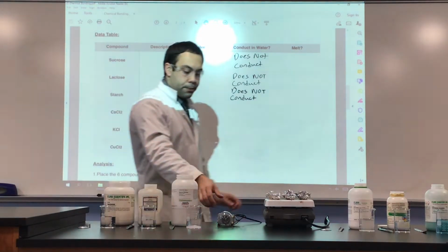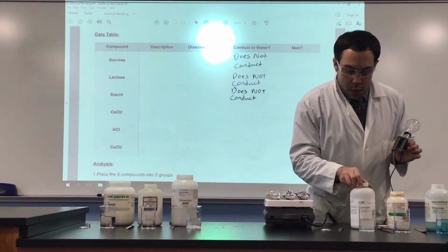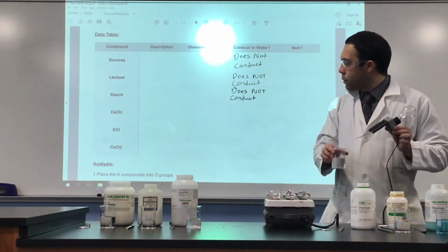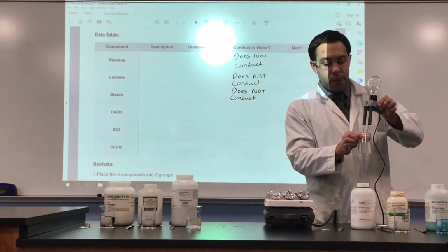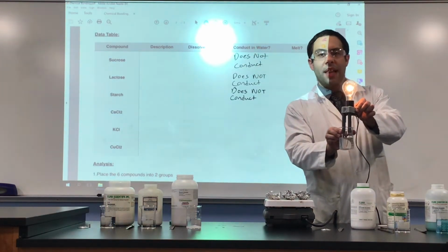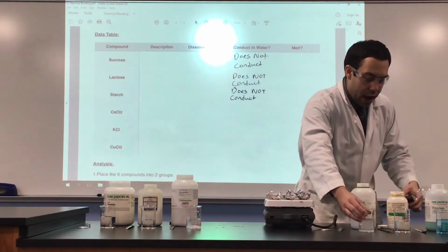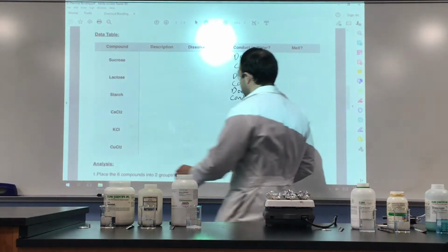Go to the right side. We start off with calcium chloride, CaCl2, light bulb in solution, and the light bulb does go on. So calcium chloride does conduct electricity.